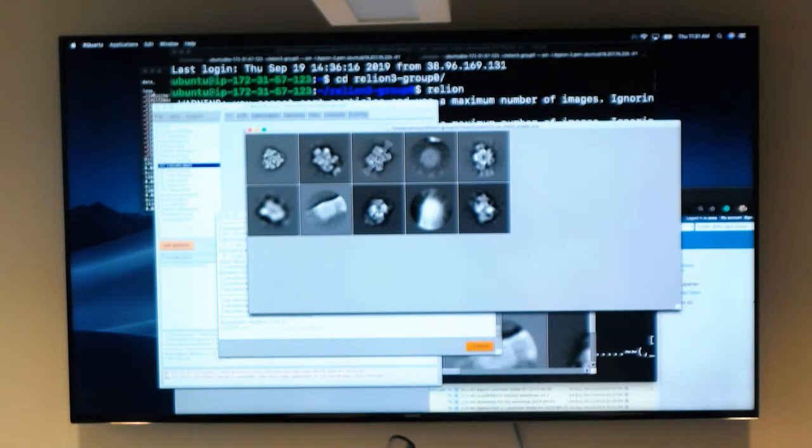And 1,000 to 1, maybe that's okay. But at a certain point, you would probably need more classes to do that in a more refined manner, to say that, okay, I really want to focus on certain particles versus another. Now, 2D is imperfect. 3D information is better than 2D, which is better than 1D, right? So 2D, I caution you during Appion Part 1, I'm cautioning you again that you can do some particle sorting, but you may not have sufficient criteria to, at a 2D level, really sort things out.